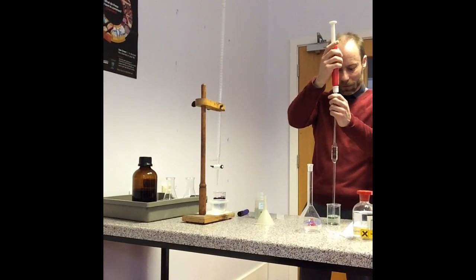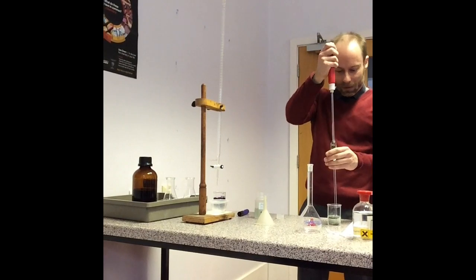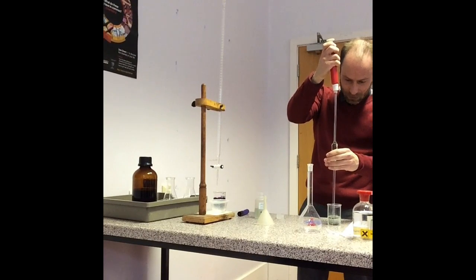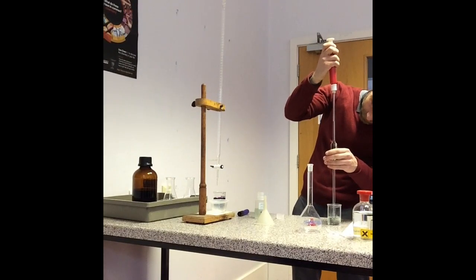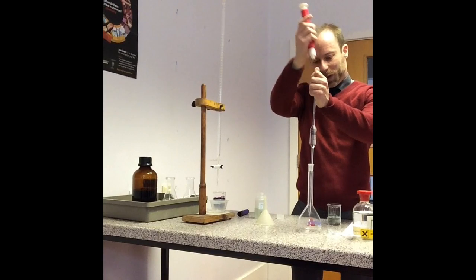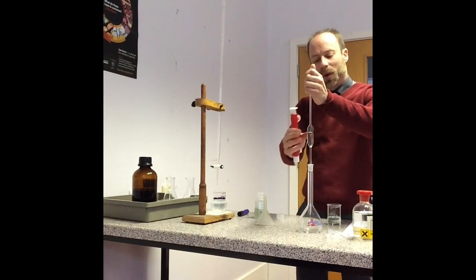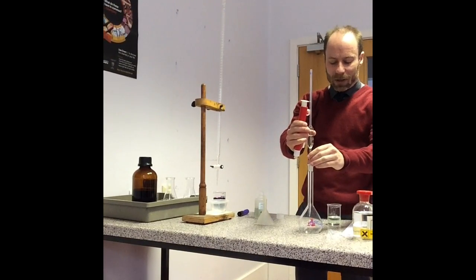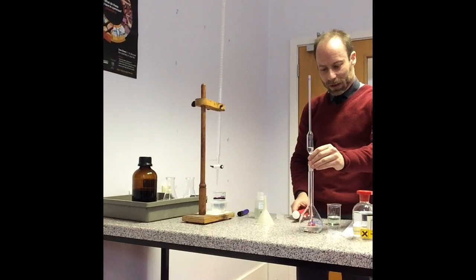There we go. So that there is 25. So put 25 into there, like so, and then I need to repeat the process. The reason why is it's too concentrated at the moment to be able to get a decent titre. So I need to dilute it down with a bit of the old distilled water.